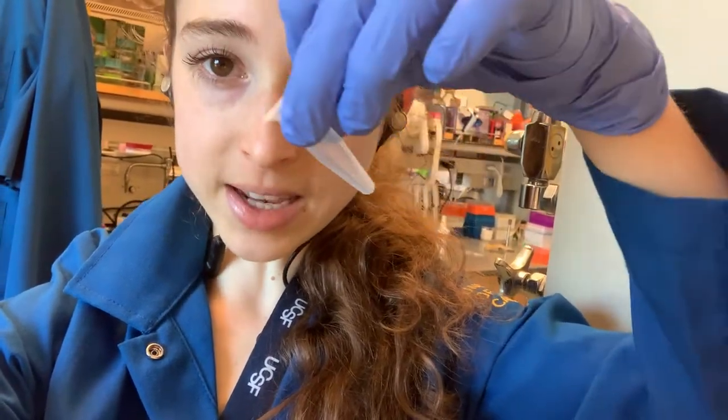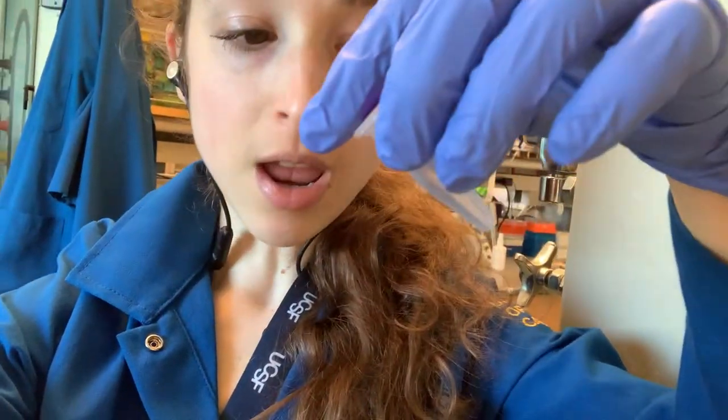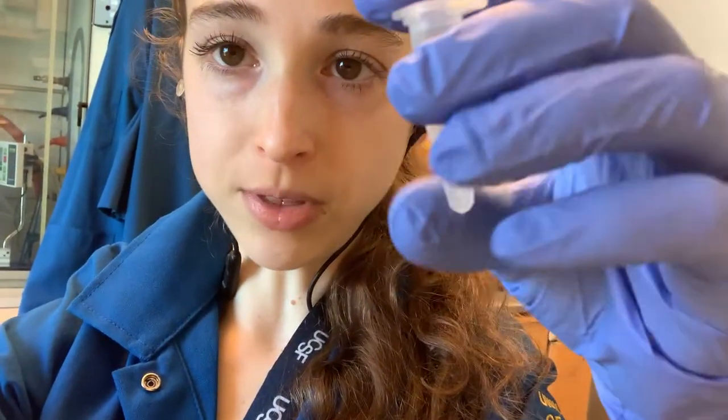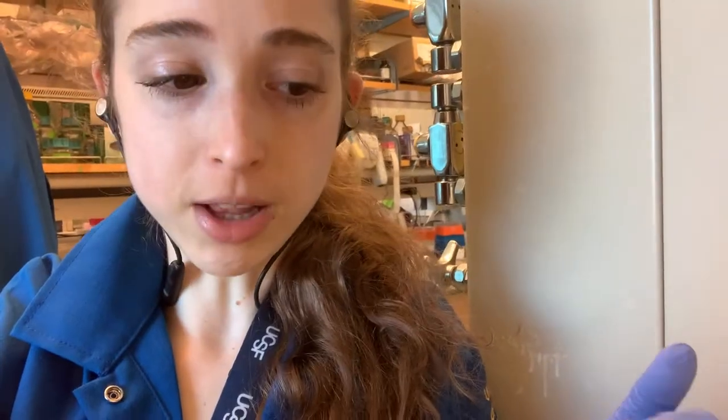When you take the tube out, be really gentle — take it out at an angle. It's helpful to process one tube at a time rather than taking all the tubes out and sticking them in your rack, because agitating them while walking around can cause the pellet to resuspend. Bring your pipette over and remove the supernatant before moving the tube. Also, for DNA and RNA precipitation, there's a product called glyco blue — it's a precipitating agent with glycogen that helps pull down the nucleic acid and has a blue color so you can see the pellet better.